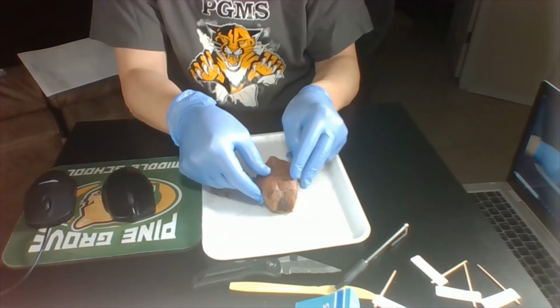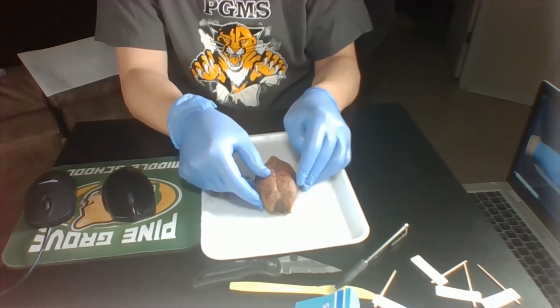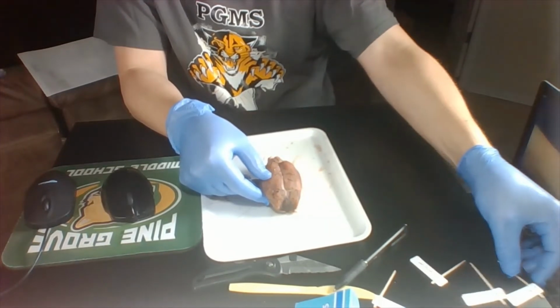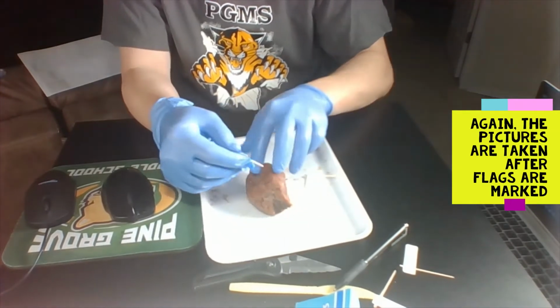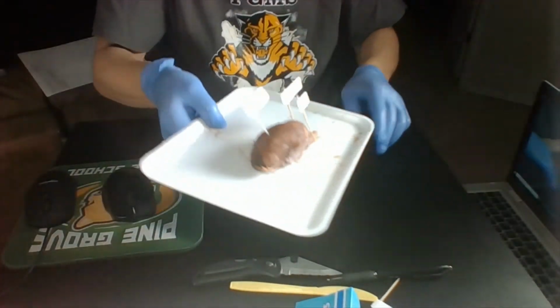Somebody's going to need to take a picture. We're not going to have phones out, so we're going to have to take the picture with your computers with your group. So I'm going to get my little flags that you should have made. And we have the brainstem, if I can stick it in here. So we have them to the other camera. And that's the first identification.